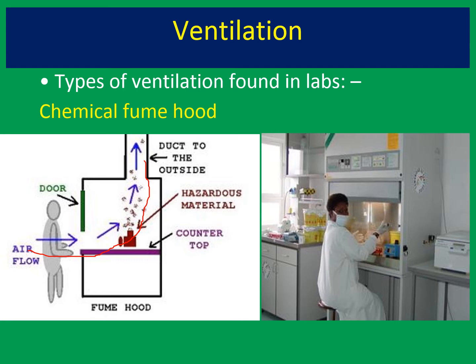It will not come inside to the classroom. So then it is safe. Imagine if toxic gas is produced, it will never come to the outside, right? Due to the airflow, this will bring all the air and suck it to the outside. That's why we are always recommended to use the fume hood for any kind of reactions. So make sure that the fume hood is working. If it is not working, then the gases will leak to the outer environment, so that will be affected.